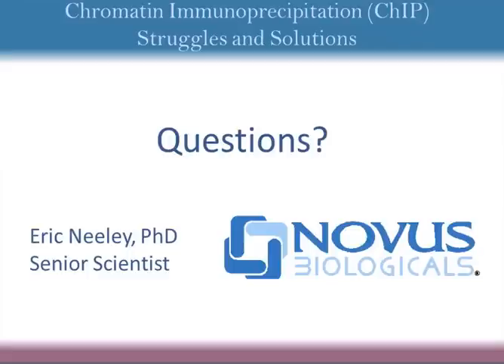Okay, so also on the antibodies, Benjamin Taylor is asking us quite a long question, so bear with me, but it's quite a good one. Benjamin says, we see no enrichment in our ChIP assays, and the antibody we are using doesn't perform well when tested in a Western blot. My supervisor argues that what's happening in the Western blot doesn't necessarily reflect what's happening in the ChIP assay. Is this a valid argument? Is an antibody that doesn't work in a Western likely to work in a ChIP assay?